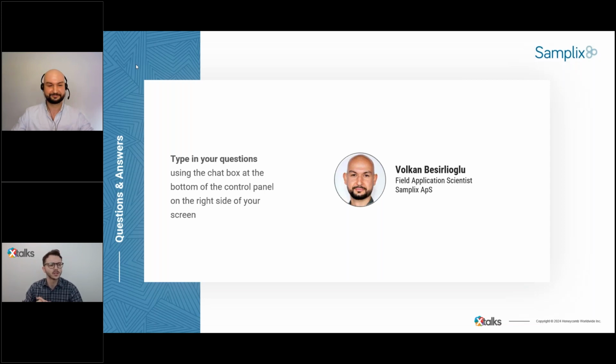You just in the answer previously spoke about how much time you can save compared to traditional screening. But this person wanted to know, could you elaborate a little bit on how fast you can actually sort? This is depending on the flow cytometer. So, for example, in this study, we sorted at 2,000 events per second, but with newer instruments, we can increase this even more. And with the Xdrop sort, for example, we work at 5,000 events per second.